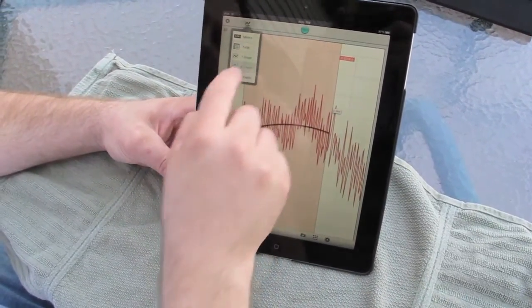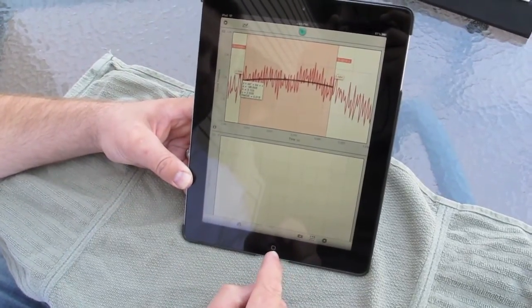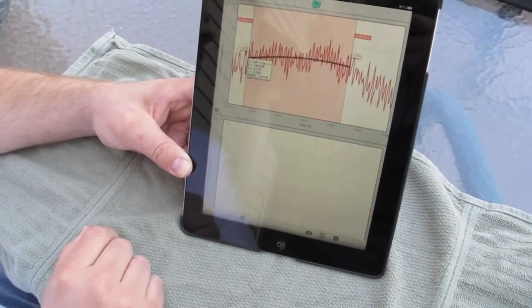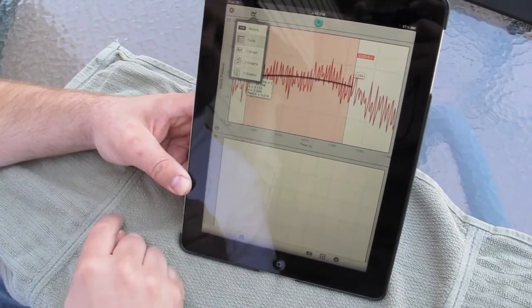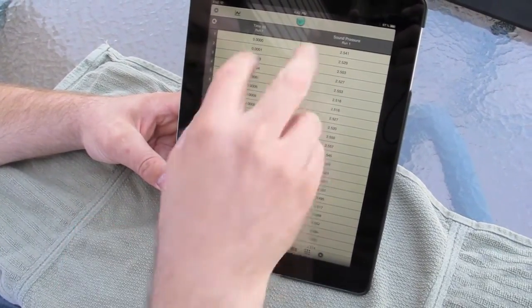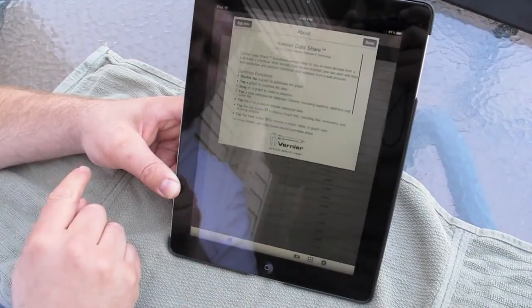There is meaning. I can change this to two graphs, so if you have two different things that you're collecting at the same time. So this isn't the graphical analysis app yet? This is not the app, no. This is just the browser app. This is a lot without the app. I could even, if I wanted the table itself, just get the table and go from the data. Look at that data. Here's the information about it.